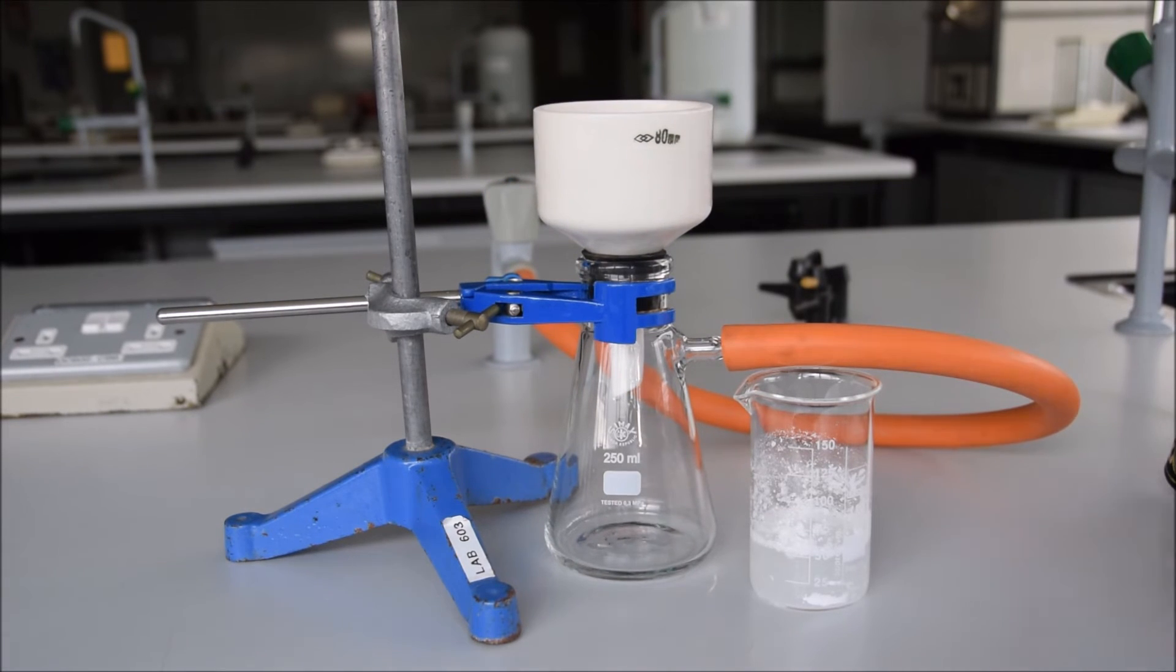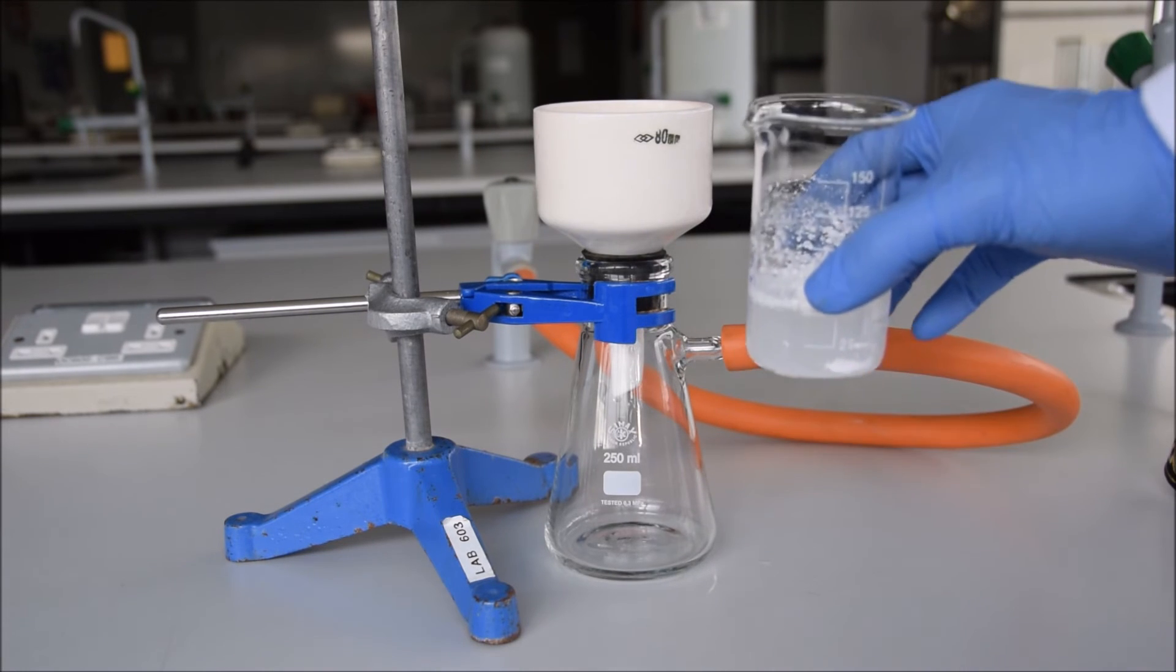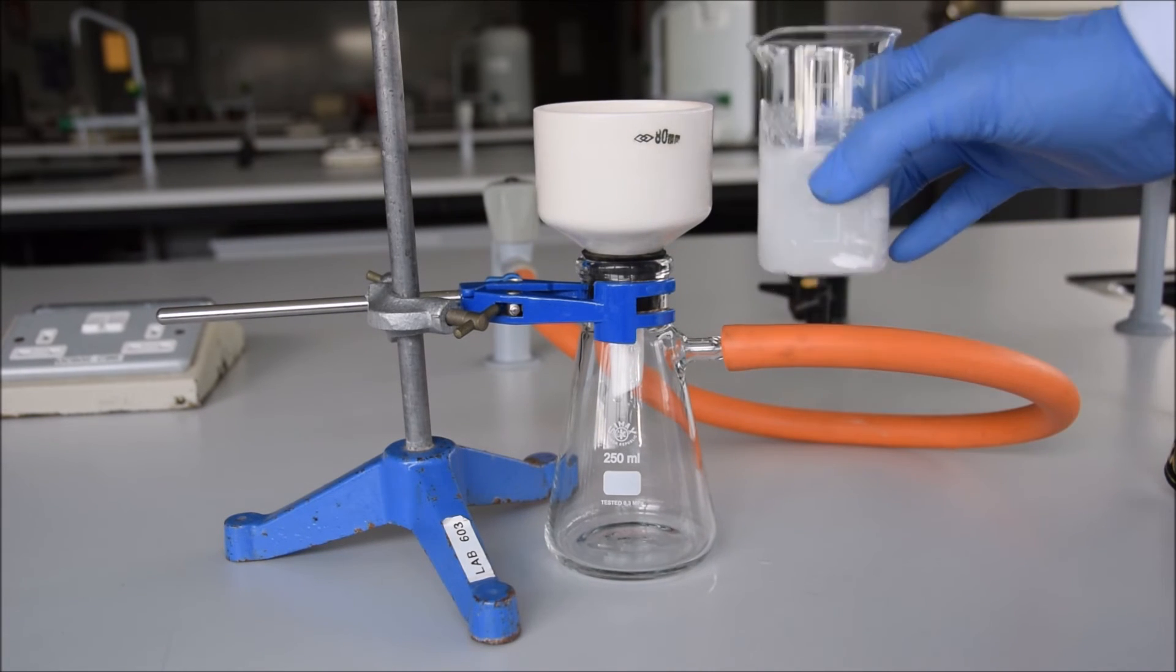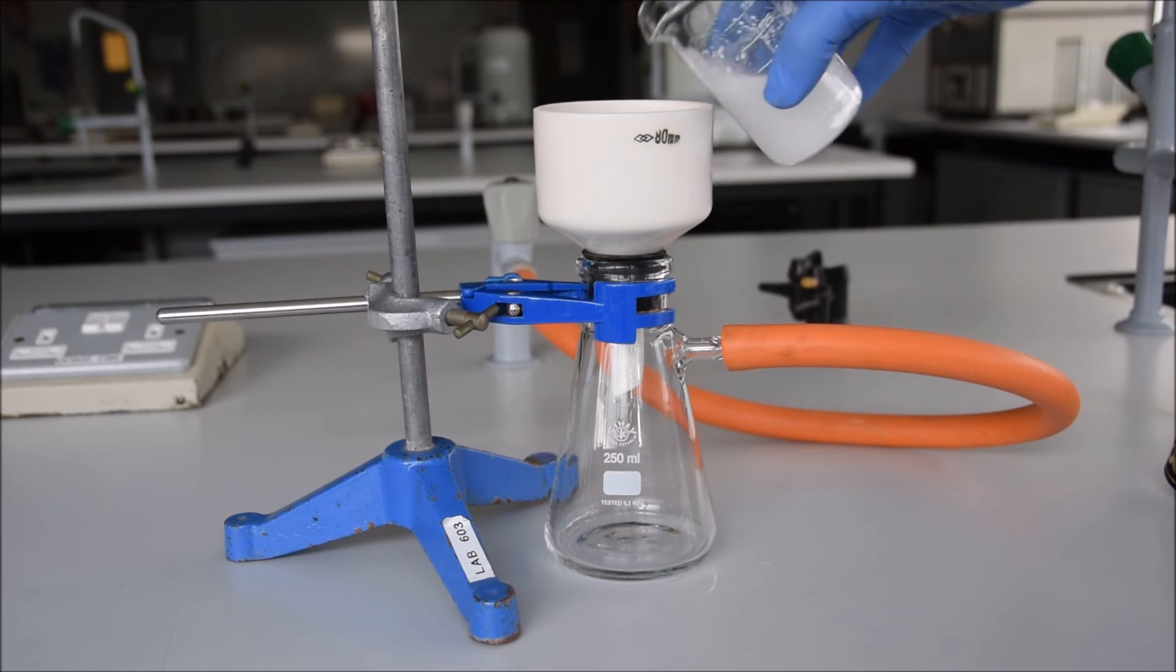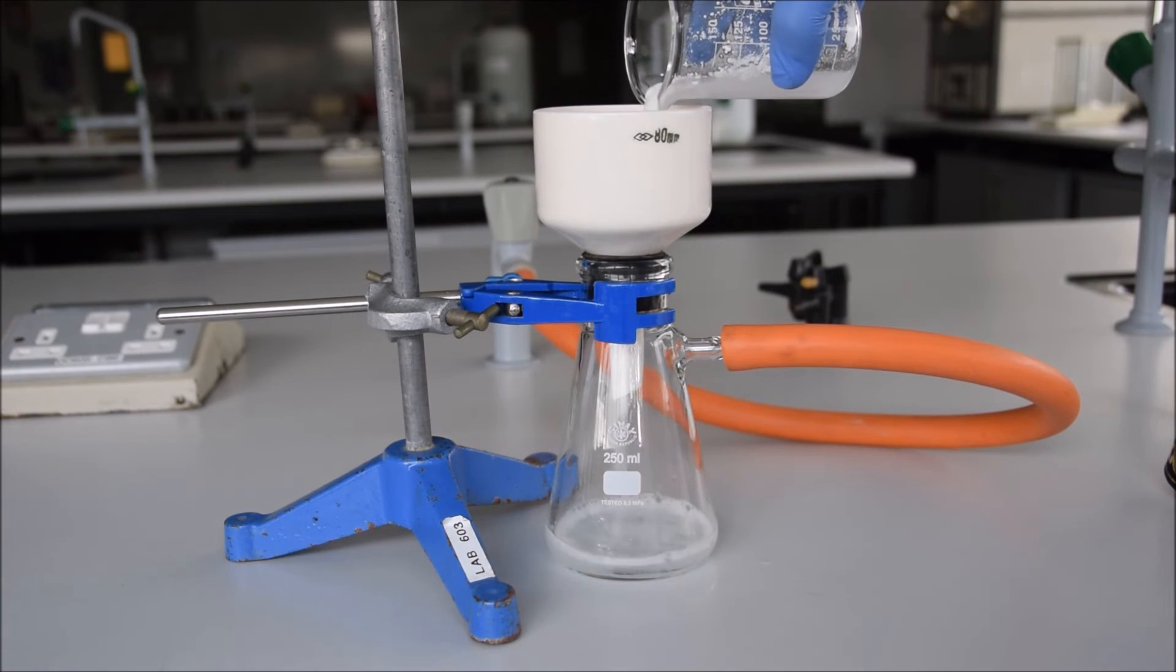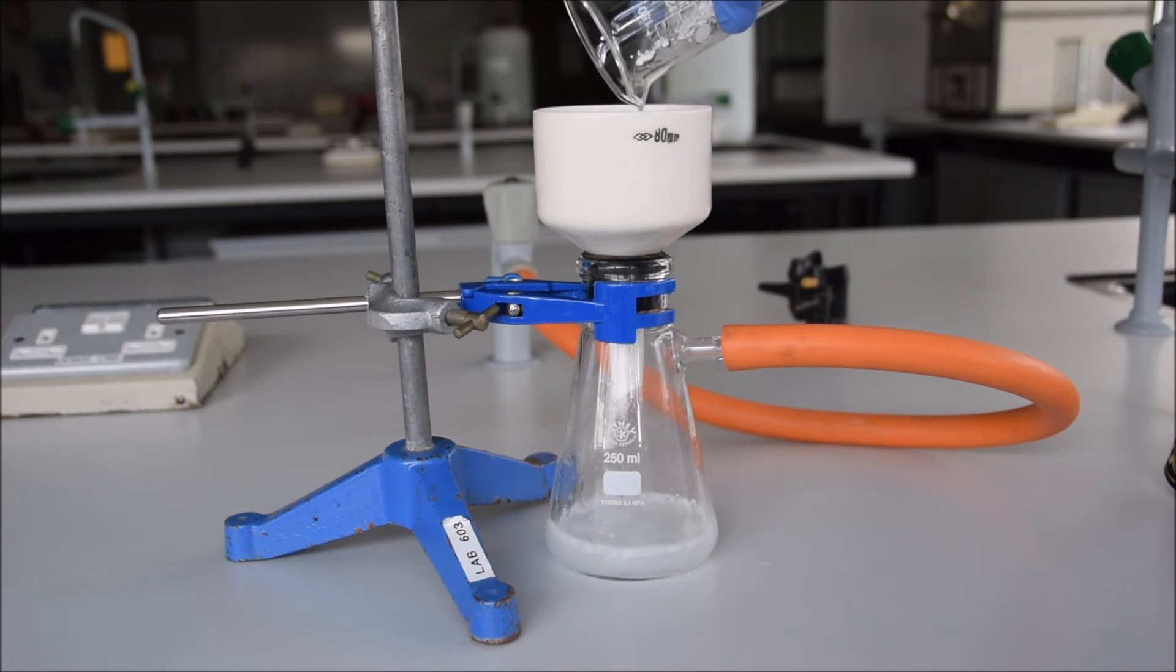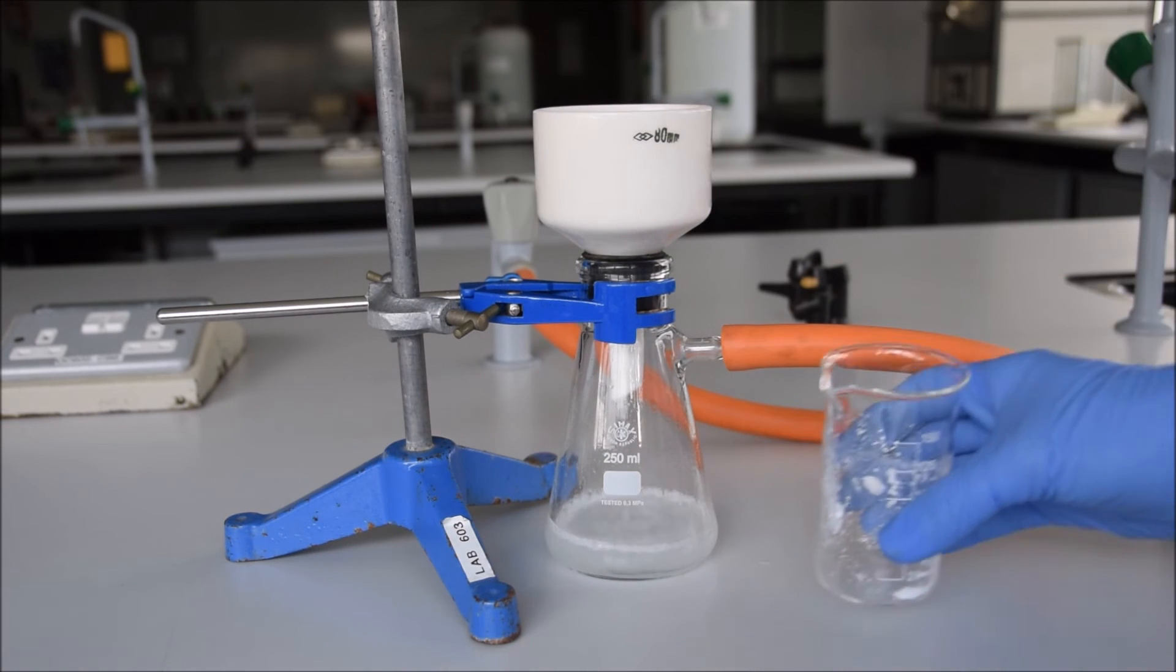The other thing that's important is to not turn the vacuum up too high. Start with that at quite a low setting. If you turn it up high you'll more than likely pull a hole through your filter paper, and when that happens your solid will end up in your flask and you'll have to start again, and it's a bit of a messy cleanup too. So try and avoid that.